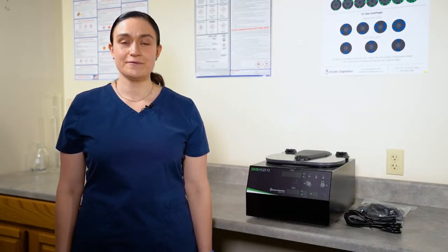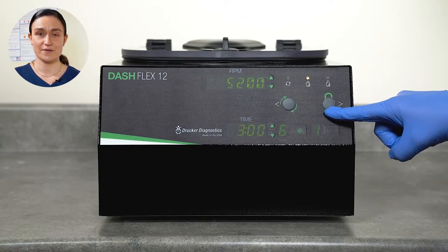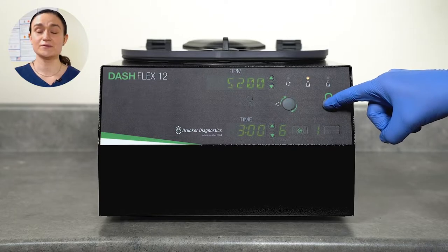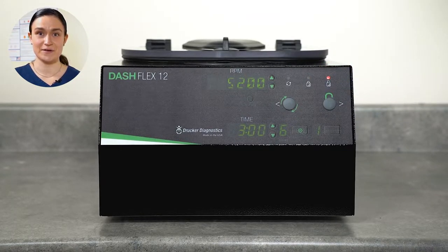Your Dash Flex 12 arrives from the Drucker factory with the safety lid lock engaged. You'll need to unlock this before you can access the centrifuge rotor and run your first tubes. In order to unlock the lid, you simply need to press the Stop Unlock button. Don't worry about the rest of these controls — we'll review what they do in just a moment.